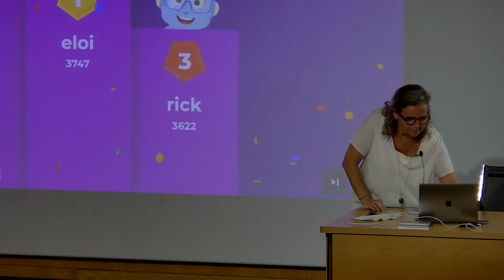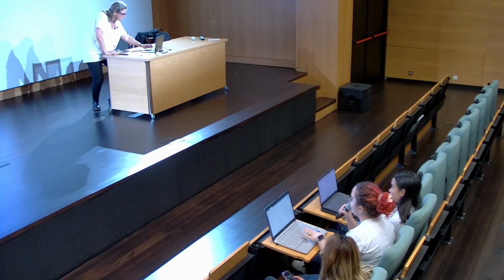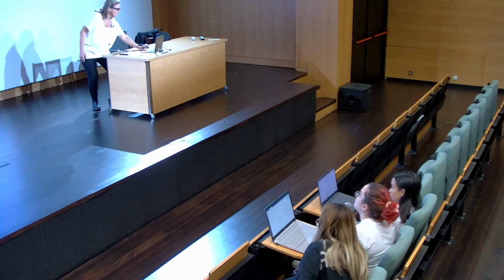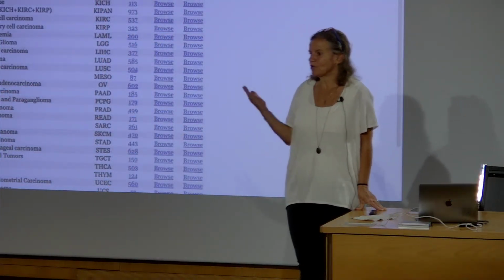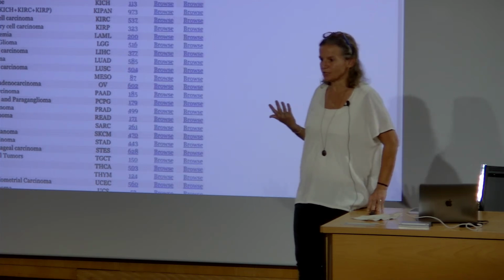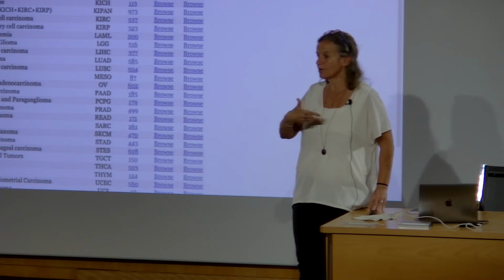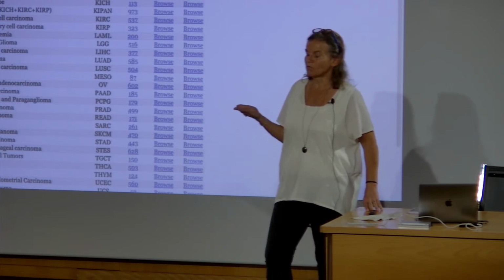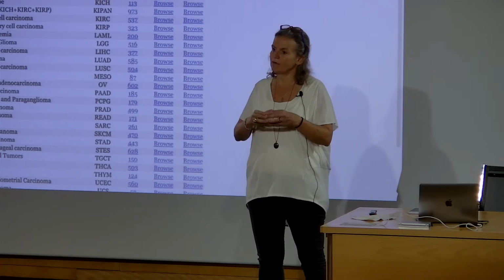Hi. I wanted to know, these technologies, aside from cancer, which one would be the best to study different types of illnesses, and why? Well, it depends on the objective that you have. But as you have seen, RNA-seq offers us a lot of advantages because you have a profile of the transcriptome very quickly, and the technology is very much spread. So you can find different genomic facilities everywhere. But for RNA-seq, you are just studying bulk RNA.